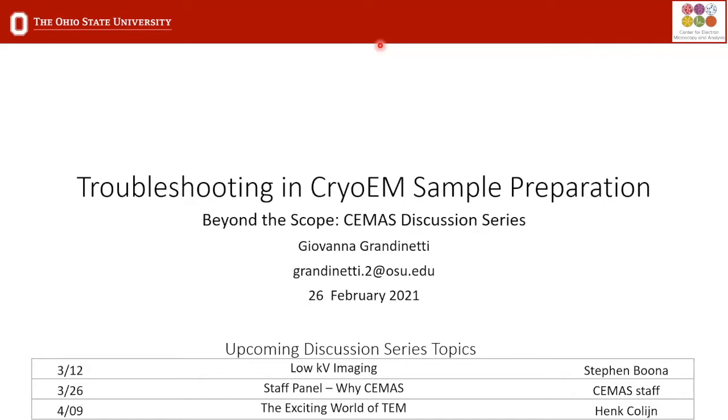All right. Thanks, Dan. So thank you for the intro. As Dan mentioned, today I'll be going over some troubleshooting with cryo-EM sample preparation.